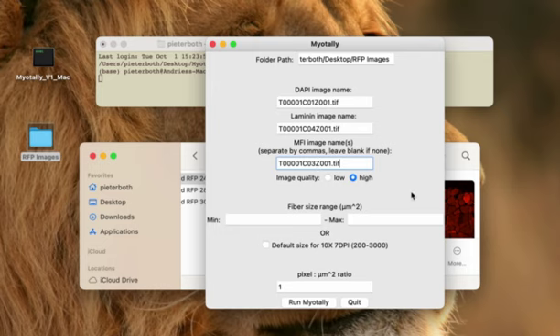The next information to enter is the image quality. If you have images that are focused well with no staining artifacts and your staining is robust and your tissue integrity is good, you can use the high image quality setting. If you have images that are maybe a little bit more blurry in some areas, or if the staining is not so robust, or if your tissue integrity is kind of poor and broken, you can use the low image quality setting to improve myofiber segmentation.